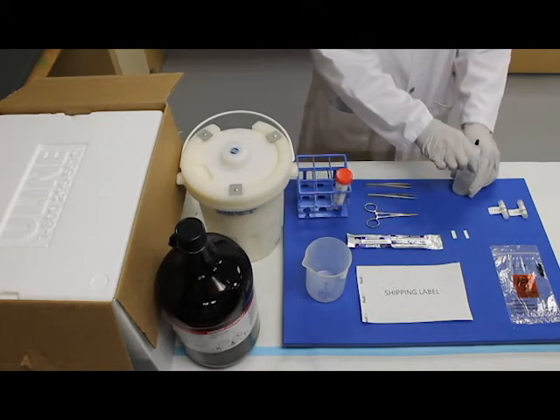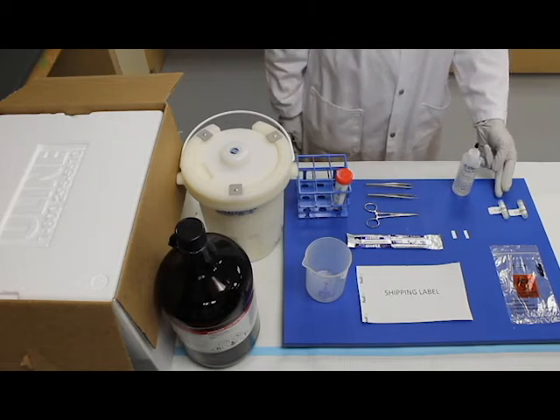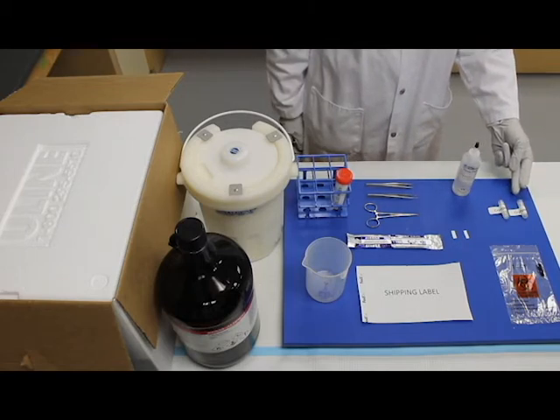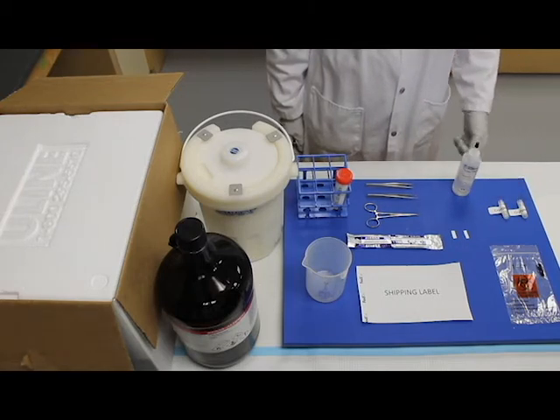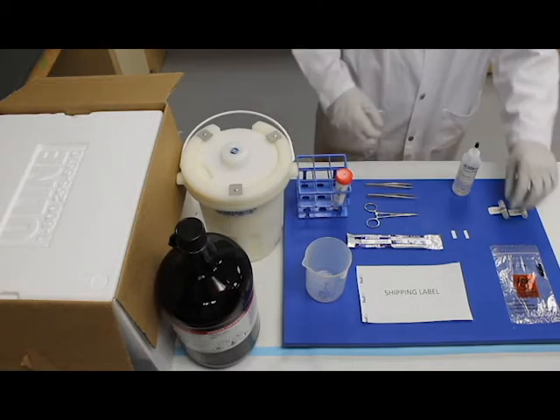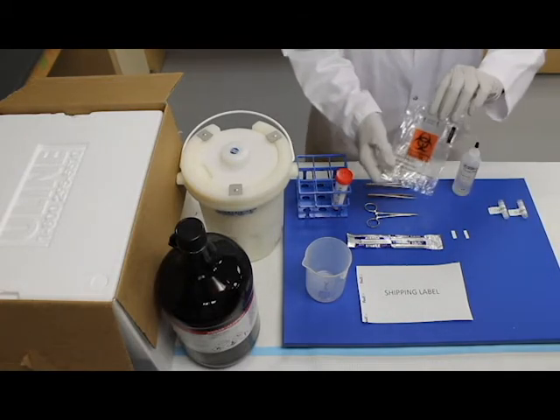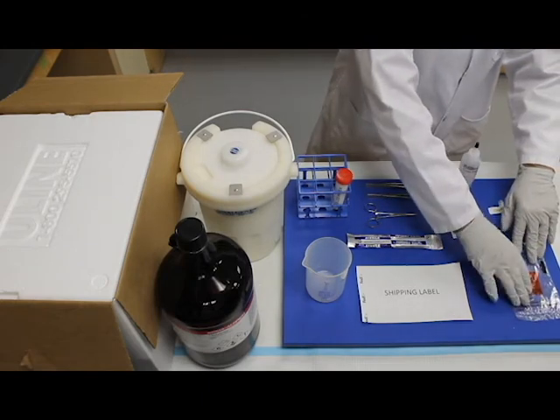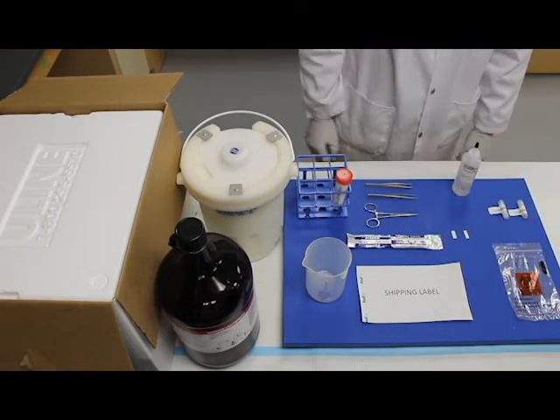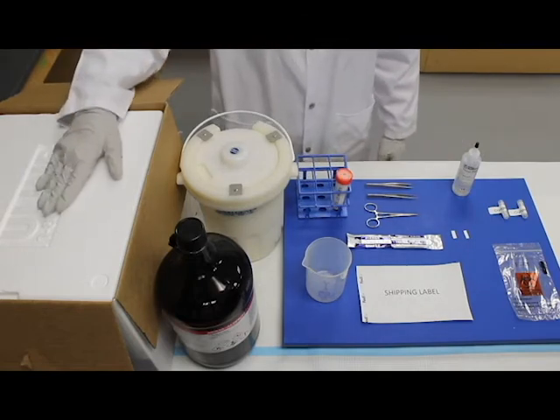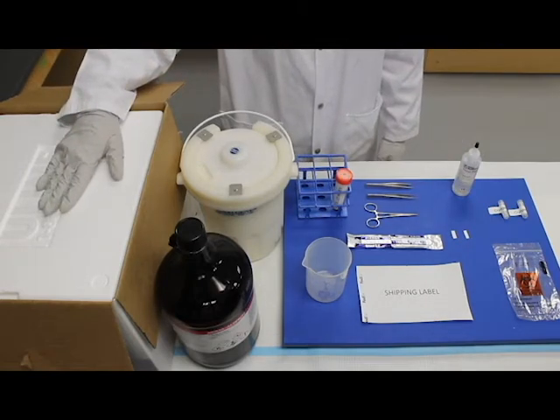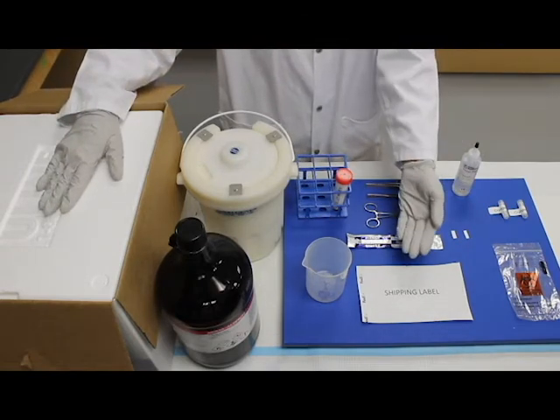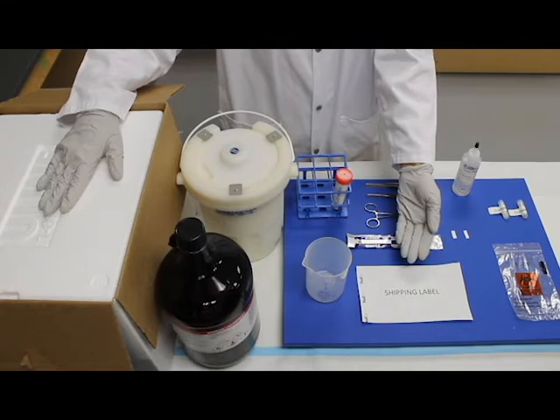Two Nalgene 2ml long-term storage cryogenic tubes, which will be used to store the tissue after freezing. One sealable biohazard sample bag used to store the cryogenic tubes once the muscle biopsy has been processed. One styrofoam shipping container used to ship the samples. A courier prepaid label is to be attached to the outside of the shipping container.